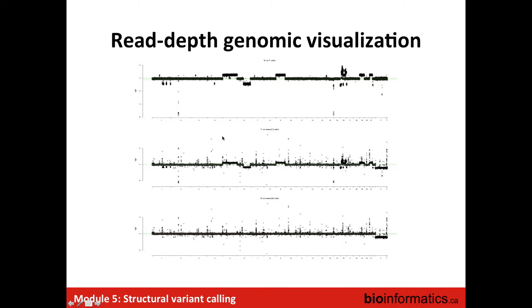So just to give you an example, this is a cancer sample. We use it on cancer, with a tool that I've developed, which is called SCONES. So you have your cancer genome, your normal genome, and you just do the ratio of the bins and plot it. And you see it's really a case where it works well, because in cancer it's really often not working well. The patterns are really evident to call.